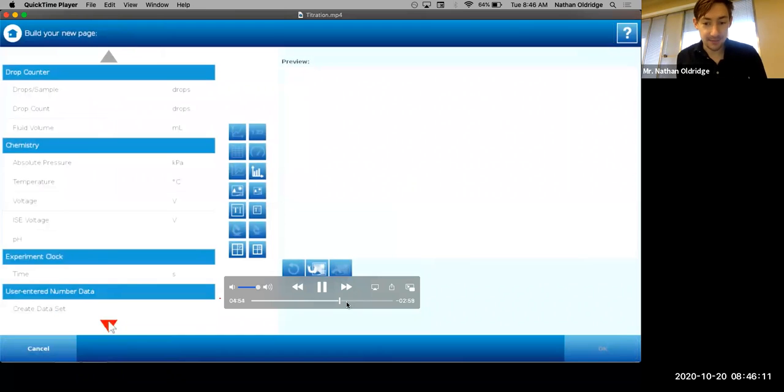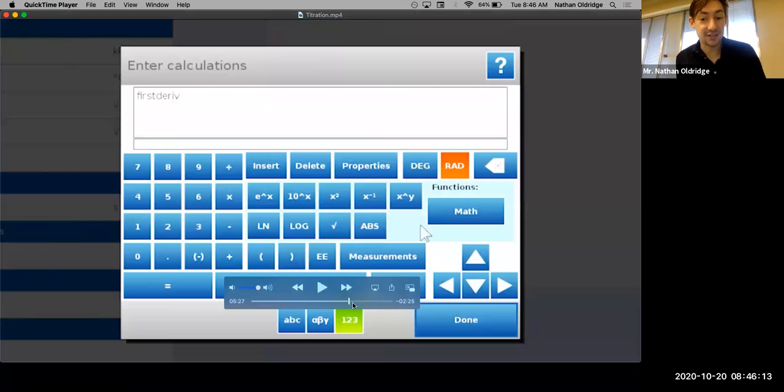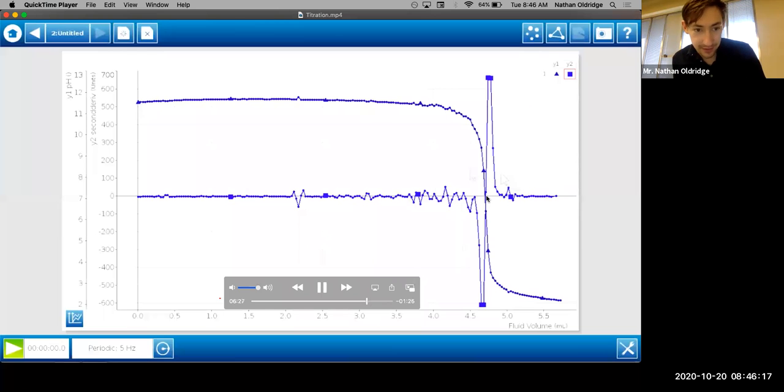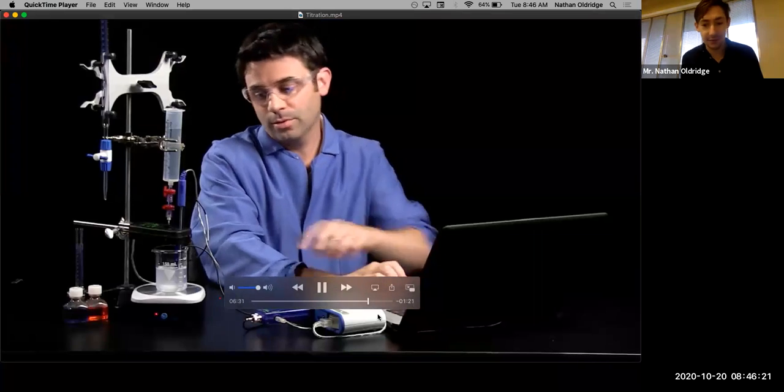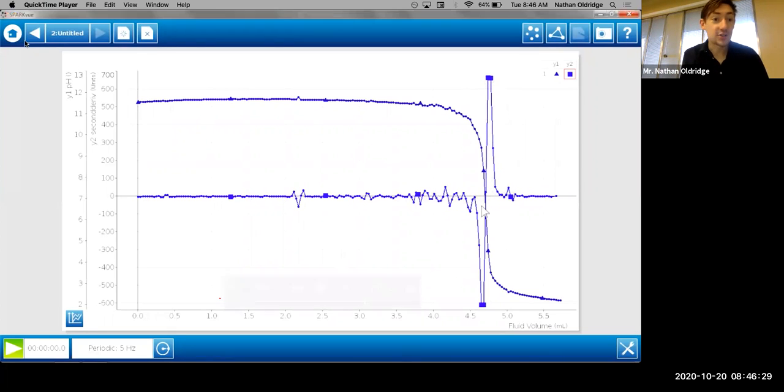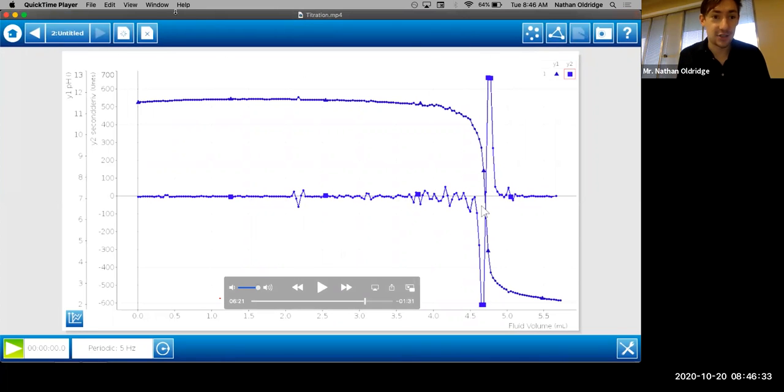He's actually got some fancy tools here. He can do the second derivative on that and then use the x-intercept to find where the equivalence point was. You can see it's close to a pH of 7. Well, he fast forwarded through that. There's your x-intercept. pH is about 7. That's gold.